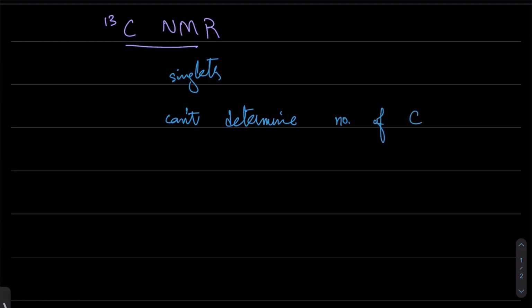Okay? Because if it's ethanol, oh sorry, ethanol has 2 carbons. They are both carbons, right? So they won't show us differently as the alcohol carbon and the other carbon. Their absorbance becomes a little bit different. Anyway, we'll look at some examples and you will understand.